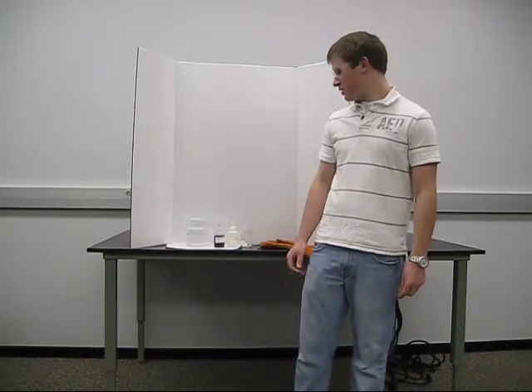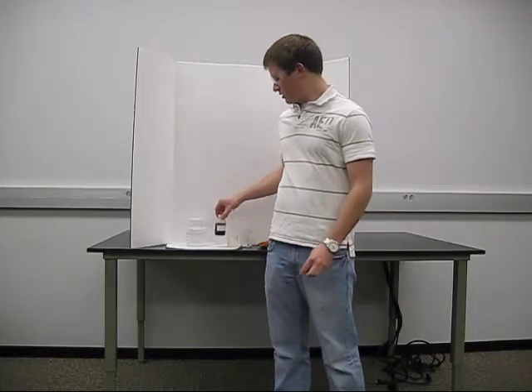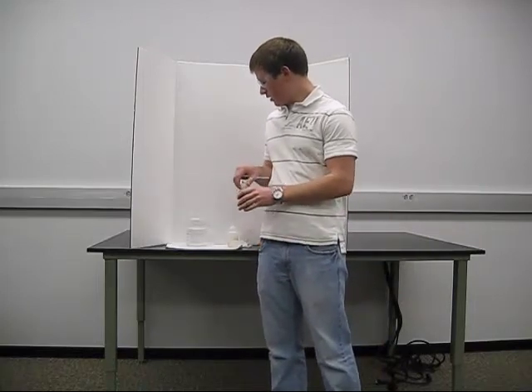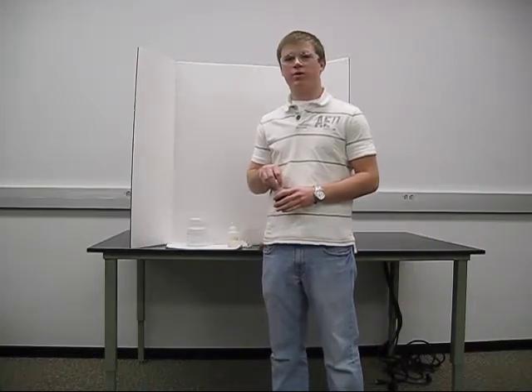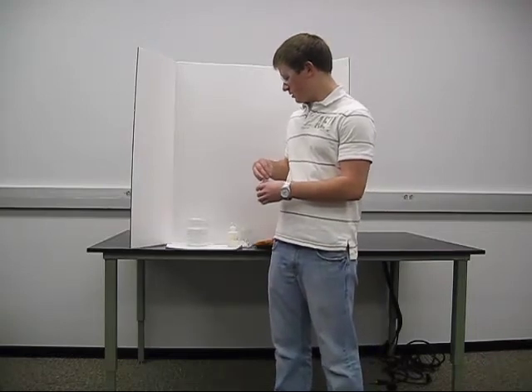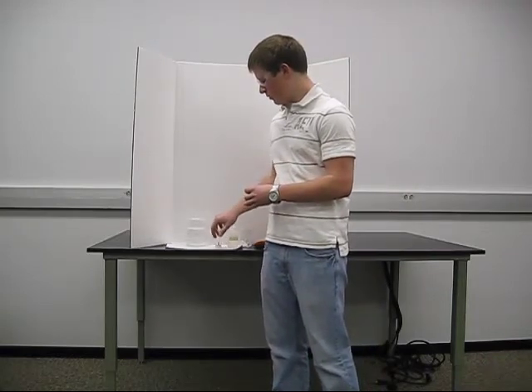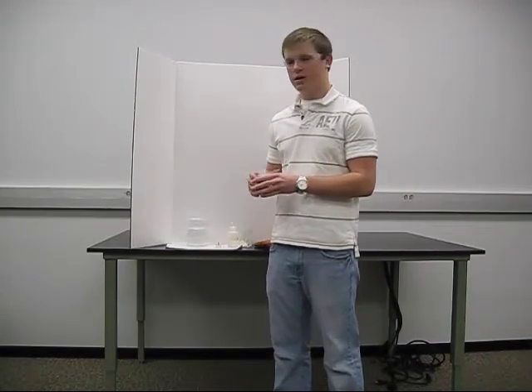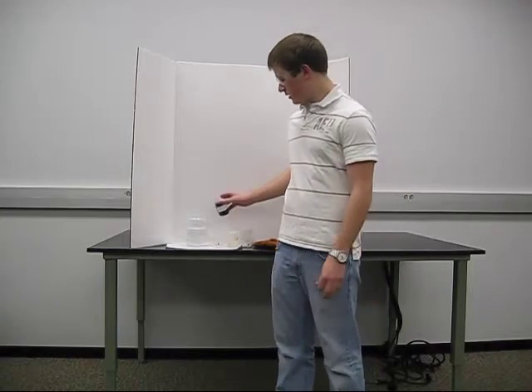For this demo, we'll be using ripe cabbage juice as a pH indicator. This is just water. We're going to make the solution basic with 0.1 molar NaOH, and adding dry ice to the solution, which will release CO2 and make the solution acidic.